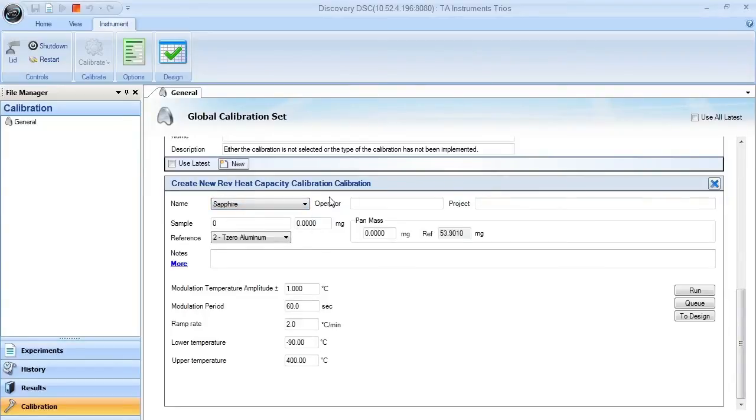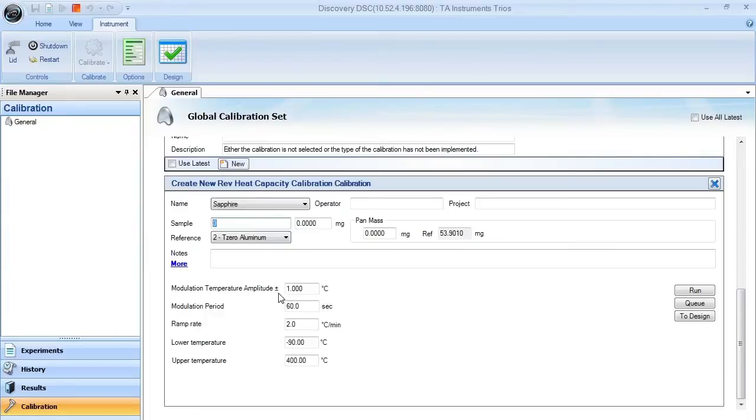You can enter in operator and project names, but the key is that you need to make sure that your sapphire pan location in your autosampler tray is correct. In this case, sample position three. You also need to make sure that your sapphire sample mass is correct as well.